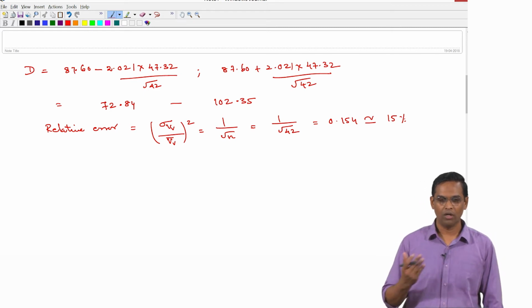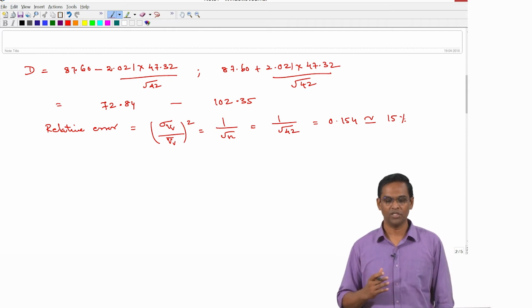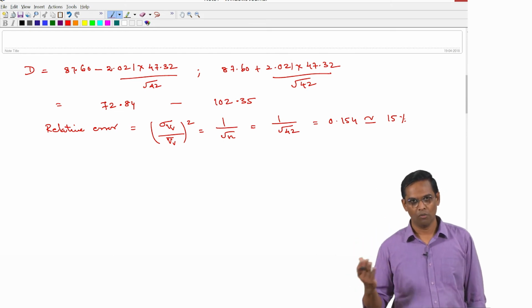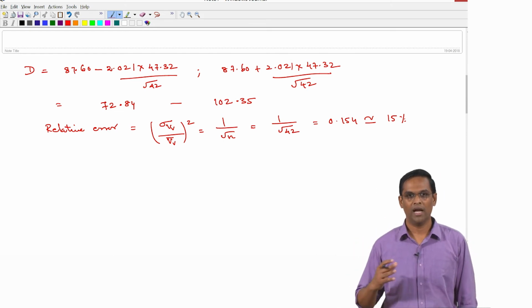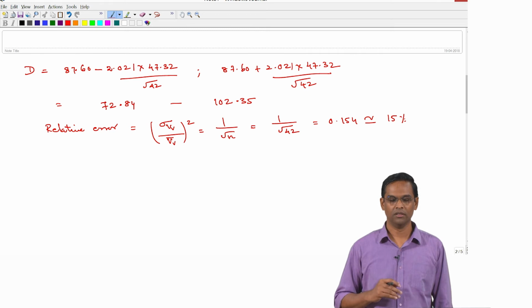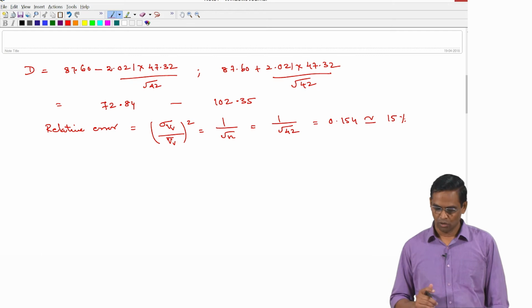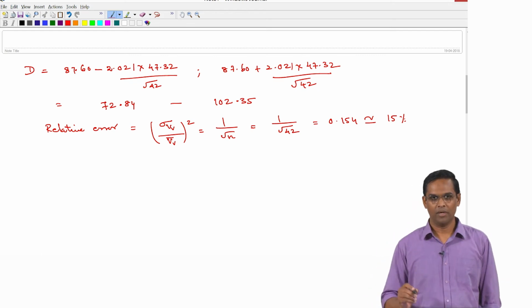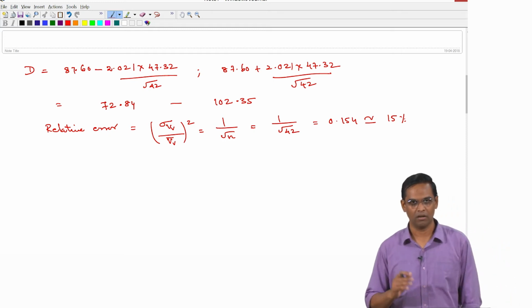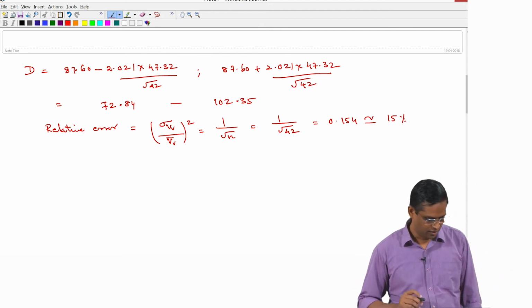You recall that if you want to eliminate much more error in this estimation, then as demonstrated in the lecture, you have to count more. For example, if you want to have the error within 5%, then you have to count more than 3000 particles in the microstructures. So, I have just shown how the data format finally appears: the 95% confidence interval range plus some error estimation.